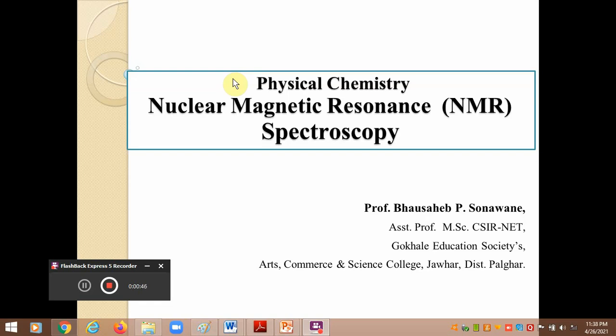Dear friends, in the last part of the video, we have gone through various concepts, and we have discussed the motion of precessing nuclei. Today in this part of the video, we are going to talk about the relaxation process shown by a spinning nucleus, how it transfers its excess energy to the surroundings. That process is known as the relaxation process.